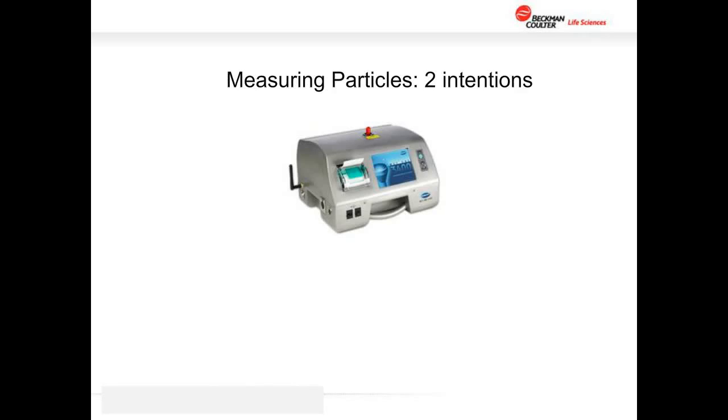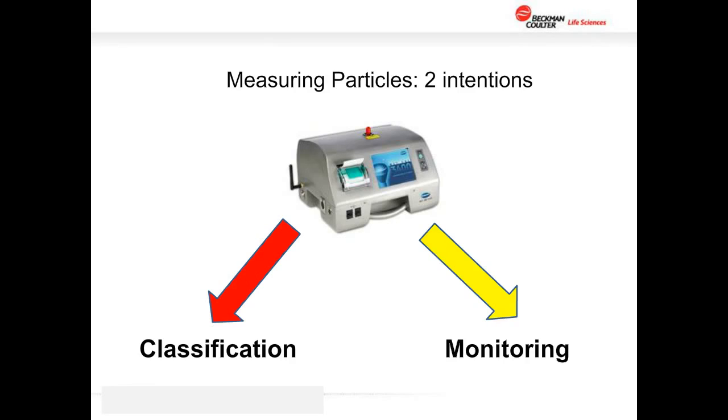One of the things that's very important to understand, and I hope everyone leaves this webinar with a clear understanding, is that even though we have instruments, particle counters, used throughout the applications here, there's really 2 fundamentally different philosophical uses for it. One of those is what we're talking about today, and that is classification. The other is a monitoring application.